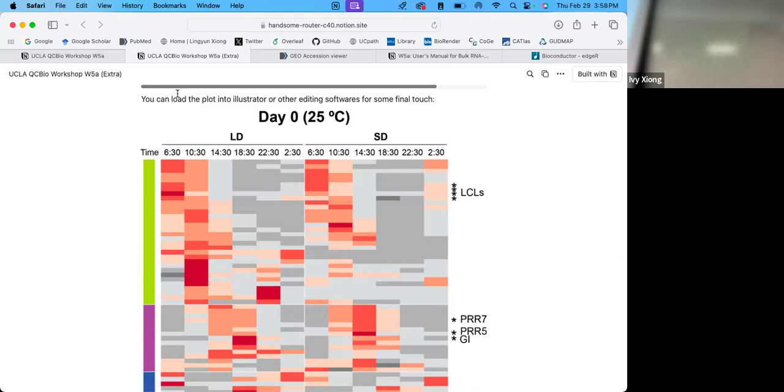I was reading through all of this. Yeah, it's pretty much the same thing. So maybe go back and then just check the content. Oh, okay. That's it. Yeah, so do LS. I see, so then here too.